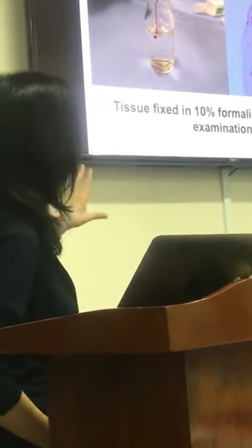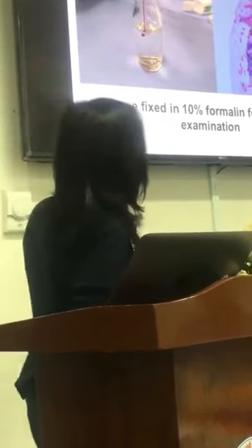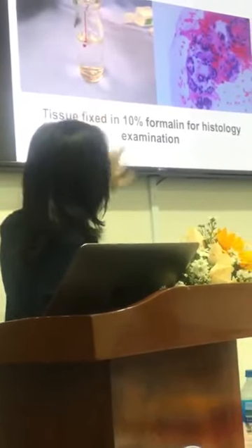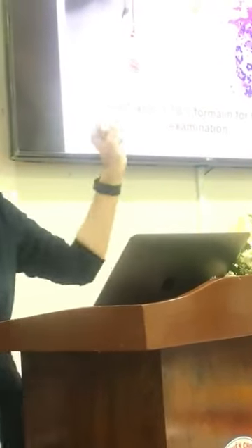this slide basically shows you how to prepare your sample for cell block. So basically, when you get your tissue sample, you put it on a slide, you smear, you send it for cytology, and the rest of the tissue you can put into 10% formalin for histology. So what they do with this tissue that you put in formalin, they're actually going to centrifuge it down, and they will remove the supernatant, and then they would get the pellet, and they would process the pellet with histology.